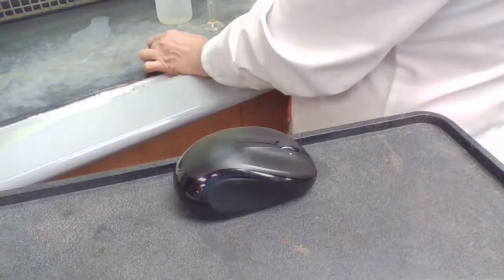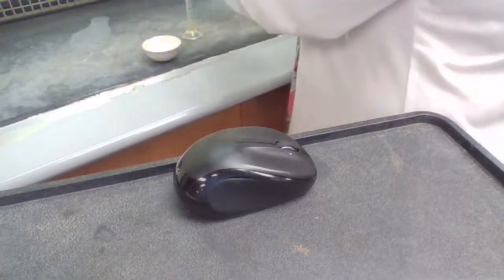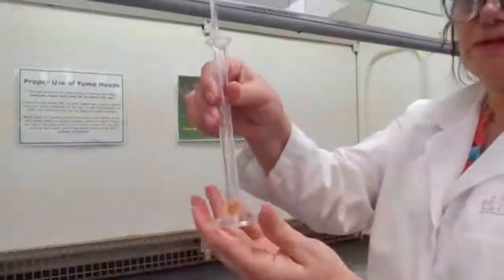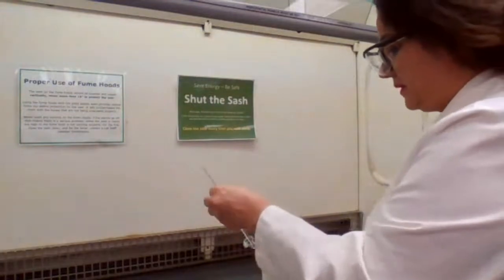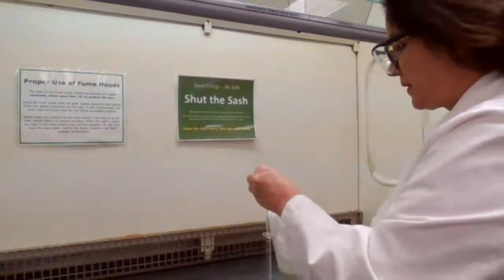Okay. I collected some drops of the solution here by placing my stirring rod in there. So I'm going to have to transfer, because otherwise I would be losing the product. Adding some DI water and transfer.